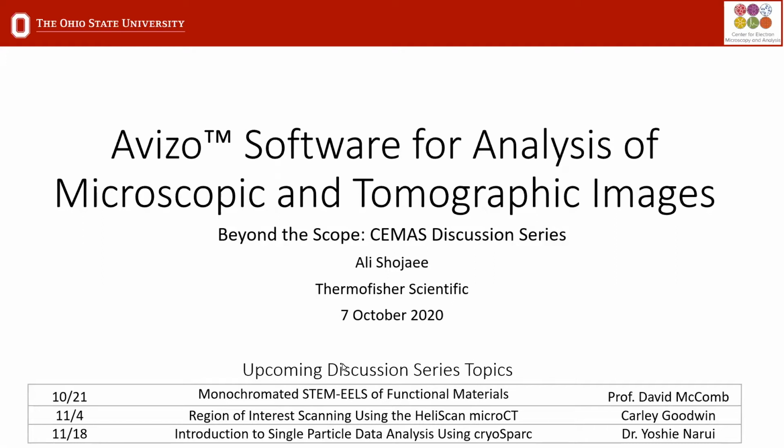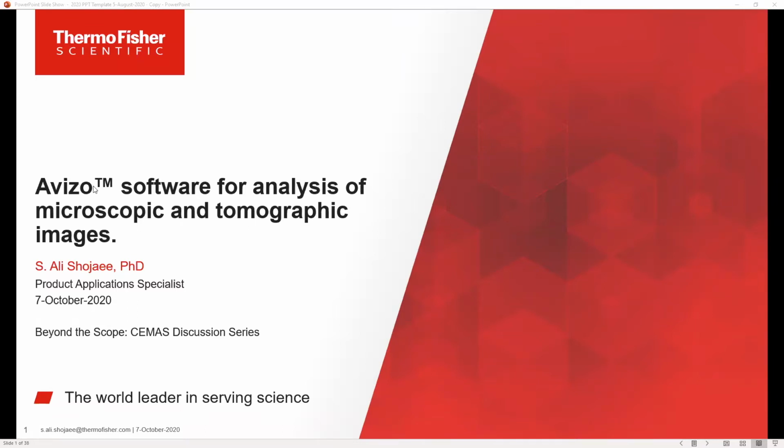All right, thank you, Daniel, and thank you everybody for attending. I'm going to go ahead and share my screen now. So what I'm going to talk about today is essentially Avizo software for the analysis of both microscopic and tomographic images.